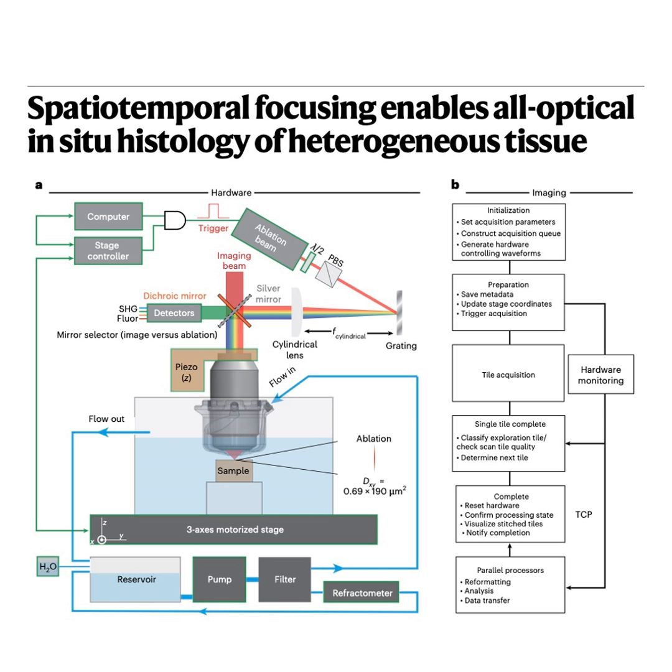And they could see the separation. Perfectly. They could resolve the thin layer of meningeal collagen separating those two vessels, which were physically very close but functionally distinct. And that delicate separation, that interface, is exactly what gets mangled by traditional mechanical sectioning, right? Because the bone and soft tissue deform differently. Precisely. Trying to slice that interface mechanically almost always leads to tearing, compression, or artificial gaps because the hard bone and soft meninges and brain react so differently to the blade. This all-optical method completely avoids that physical distortion.